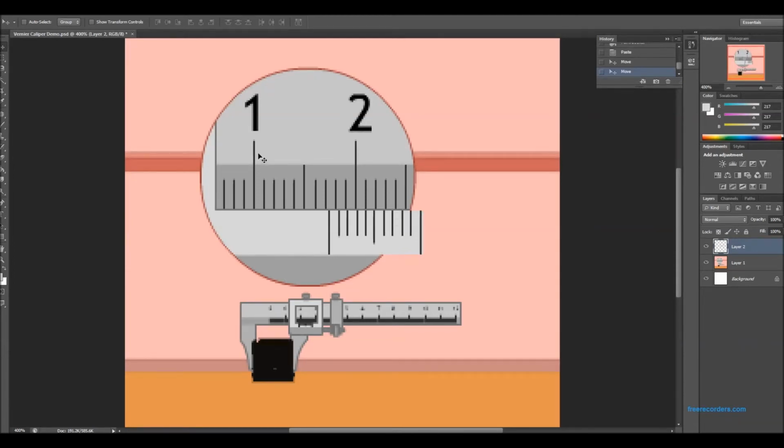So this pretend cube that we have just made up is 1 point, that's the 1.5, 1.6. This is 1.7, and it's just a little bit over 1.7. So where do our lines line up just right? It looks like this one lines up just right. So we said it was 1.7. That would be 1.71, 1.72, 1.73, 1.74. So we would write 1.74 down. I'm going to do one more.